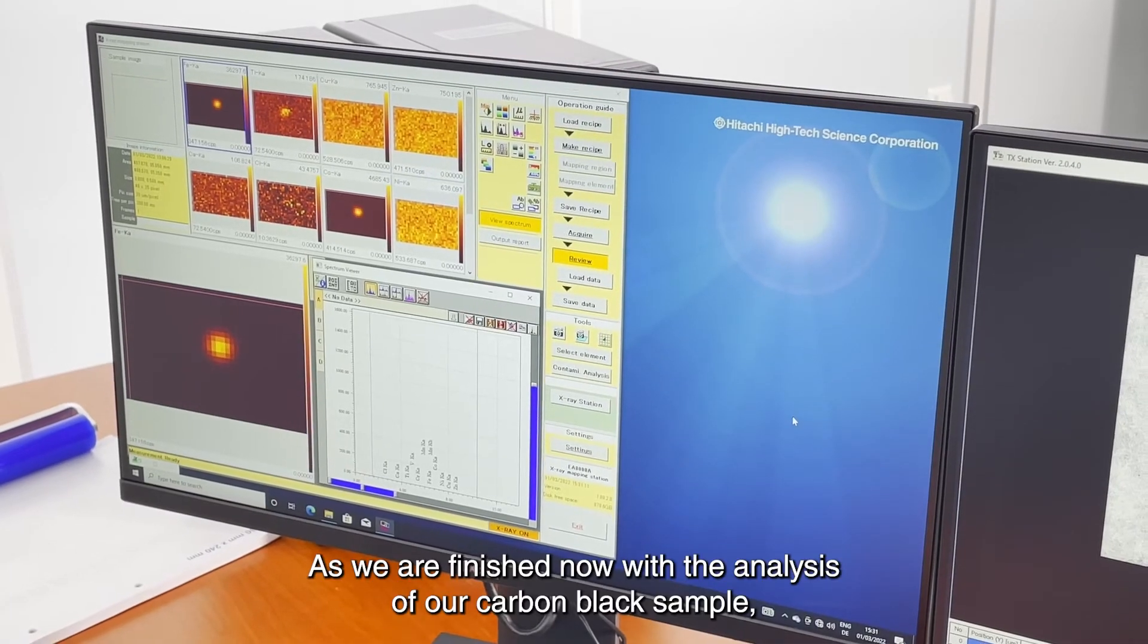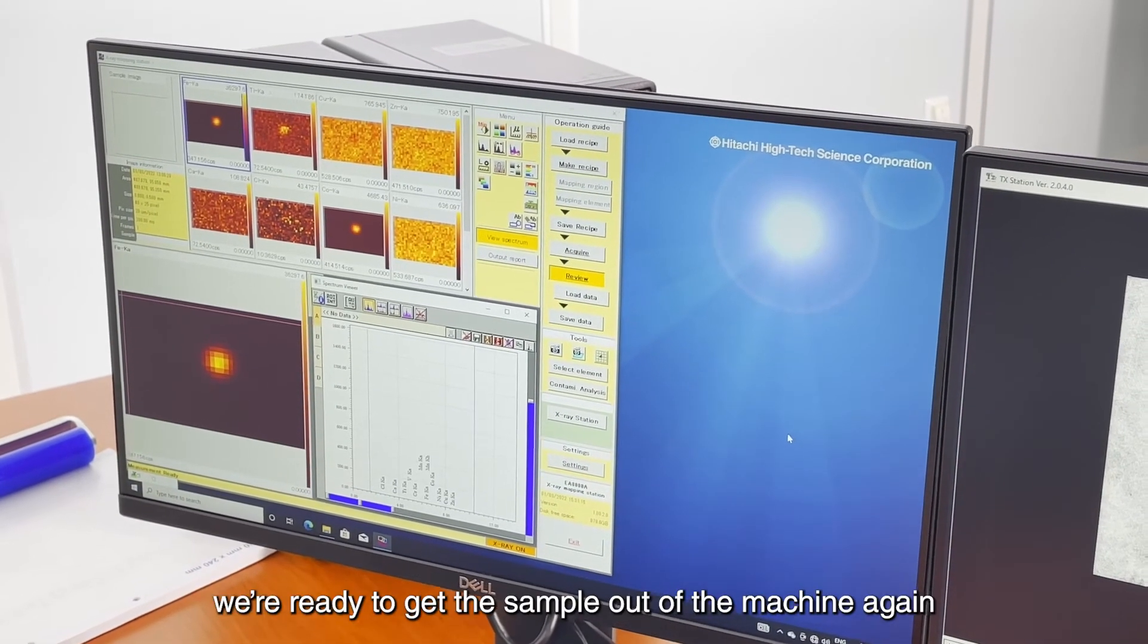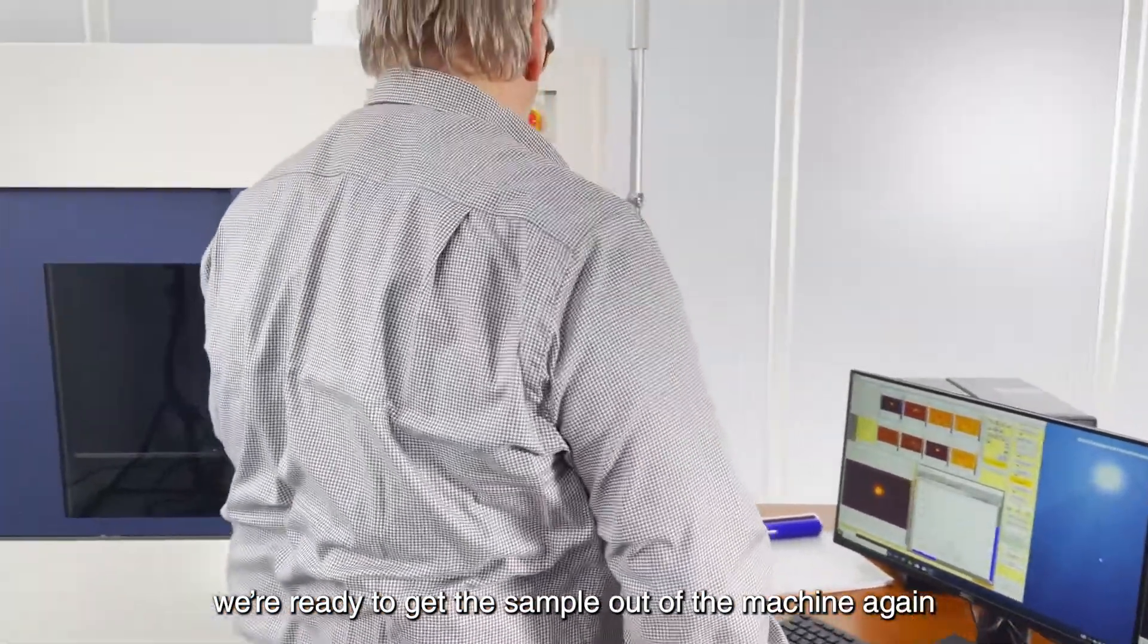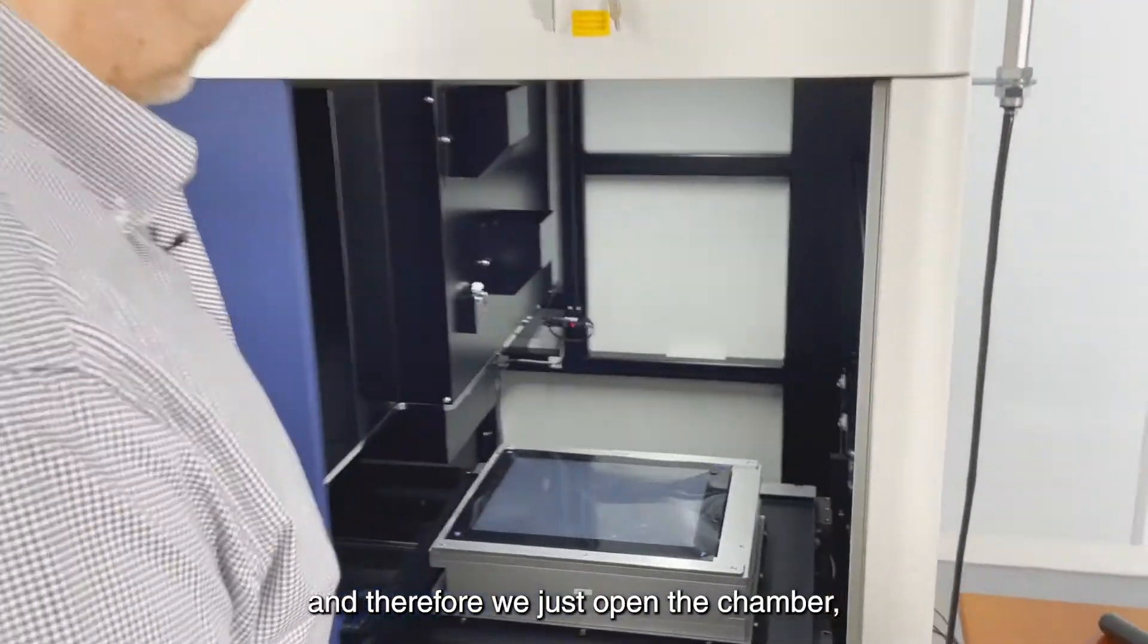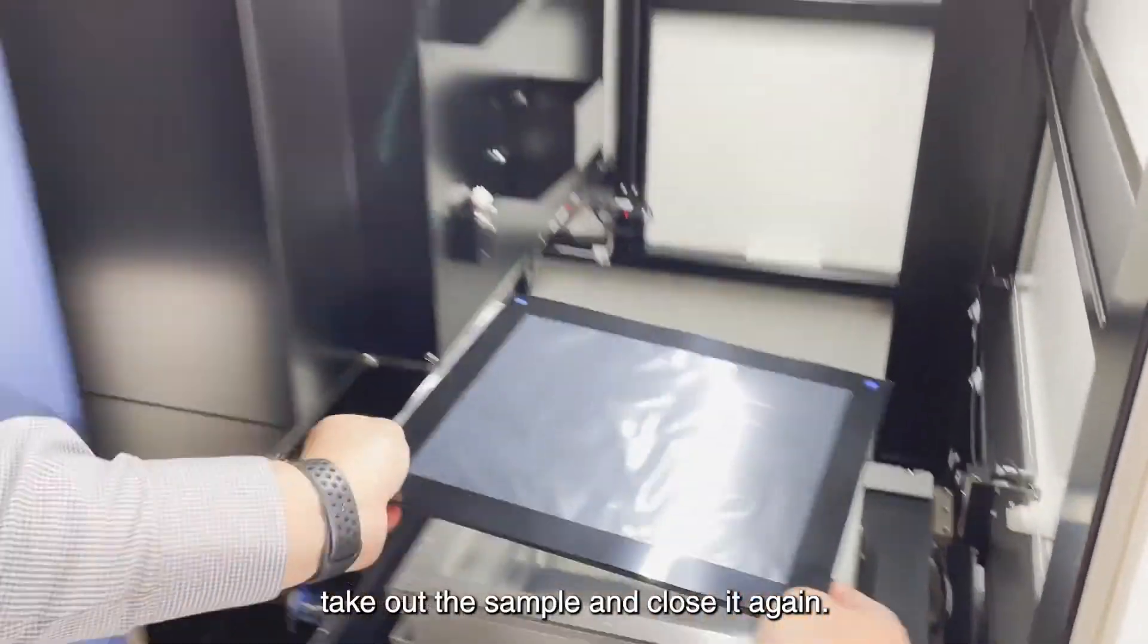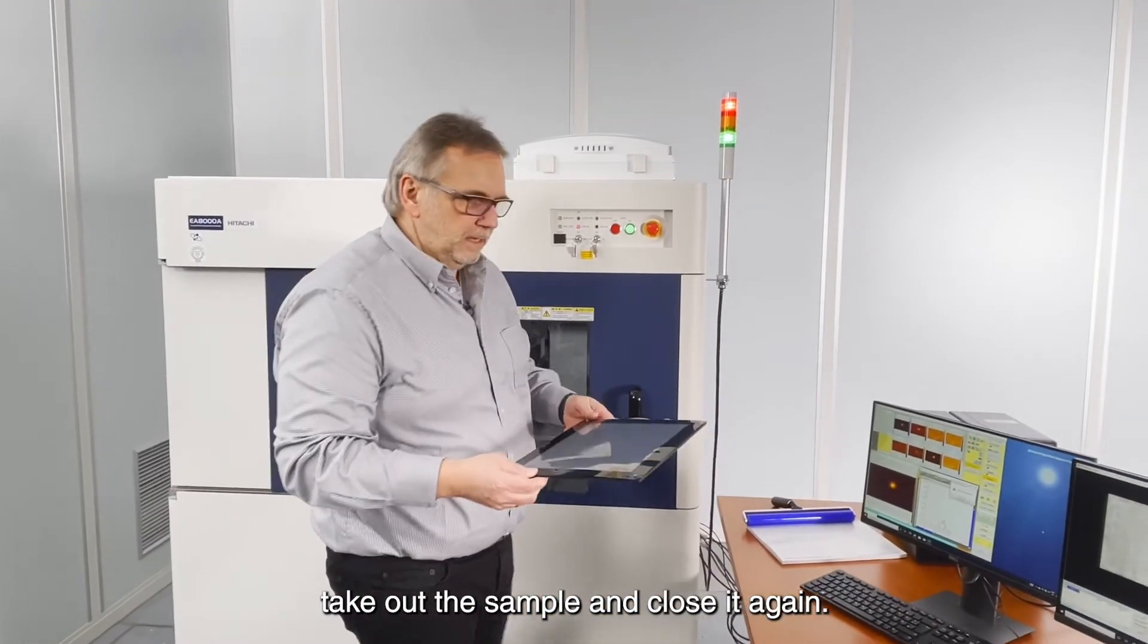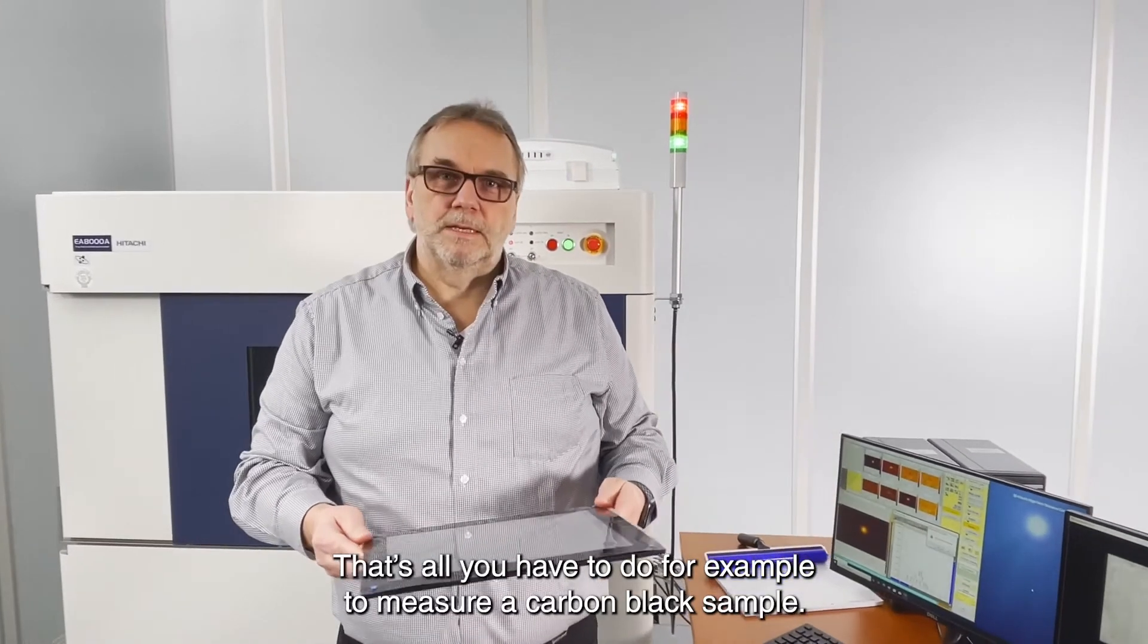As we are finished now with the analysis of our carbon black sample we are ready to get the sample out of the machine again. Therefore we just open the chamber, take out the sample and close it again. That's all what you have to do for example to measure a carbon black sample.